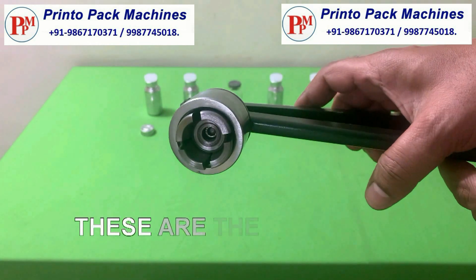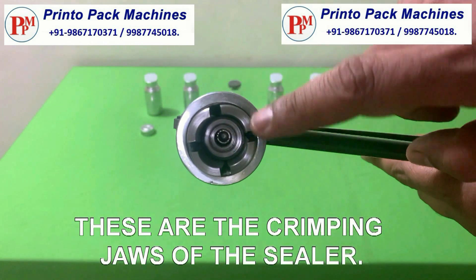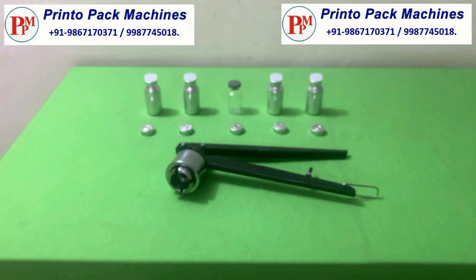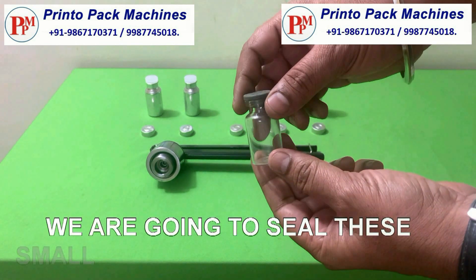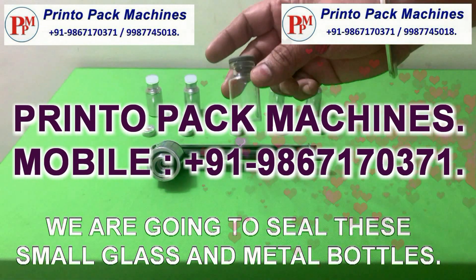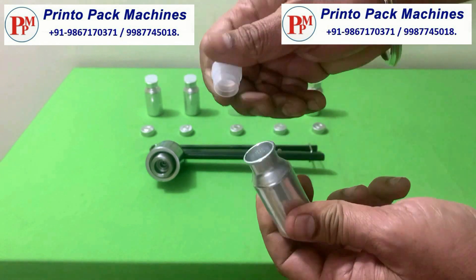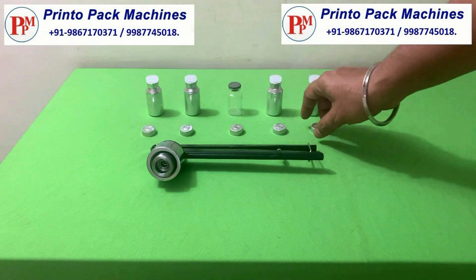These are the crimping jaws of the sealer. We are going to seal these small glass and metal bottles. This is the Aluminum Vial Seal for sealing bottles.